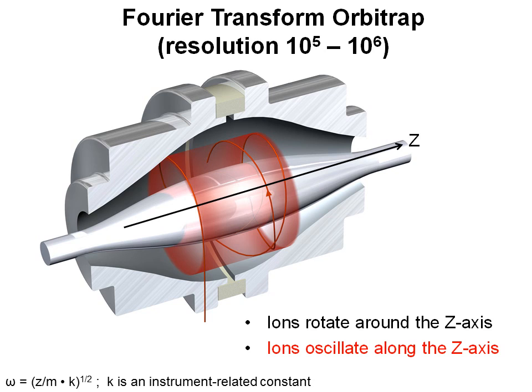While only introduced in 2004, the Fourier transform Orbitrap mass analyzer has gained considerable popularity in the last 10 years. Many instruments have been sold despite the fairly high price. Why is that? The mass analyzer is fairly small, making this a benchtop instrument, but with the resolution of the much bigger and more difficult to use ion cyclotron resonance mass analyzer.